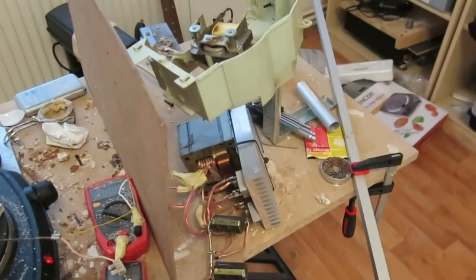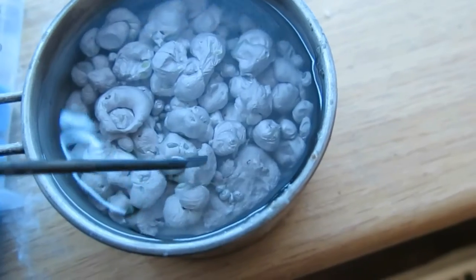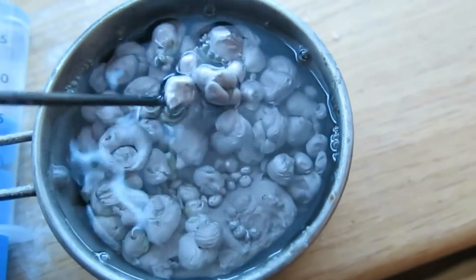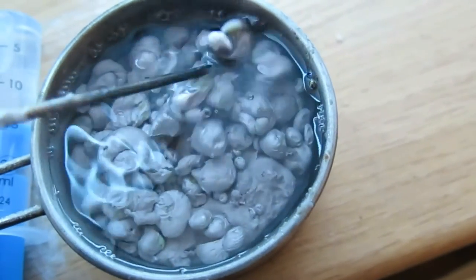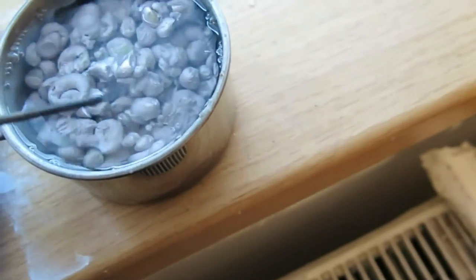A fan is used to cool the transformer and rectifiers. This is about 150 grams of sodium I have made. Small chunks are contaminated by sodium hydroxide because I used a bad extraction method.